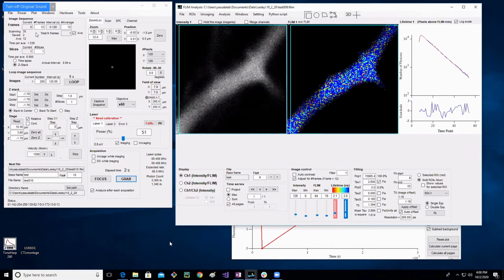If you want to do extremely fast imaging, that might not be the case. You might just use individual frames to analyze your data, because that will allow you to image very rapidly. But for most typical imaging that we do in the lab, frames are a tool to increase our signal to noise. All right, so if that's a frame, what's a slice?